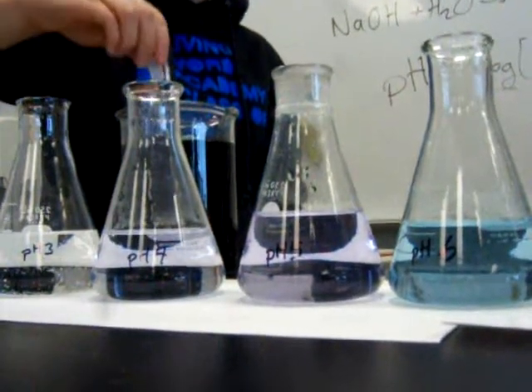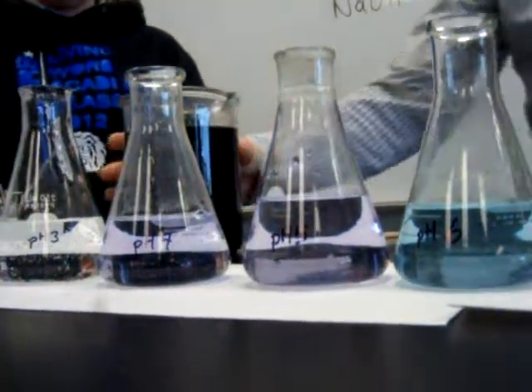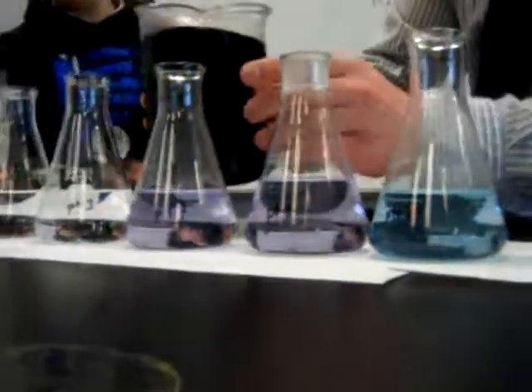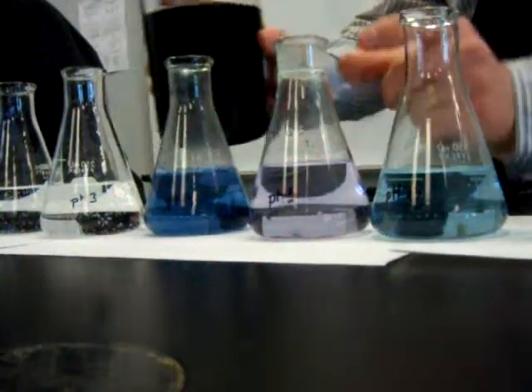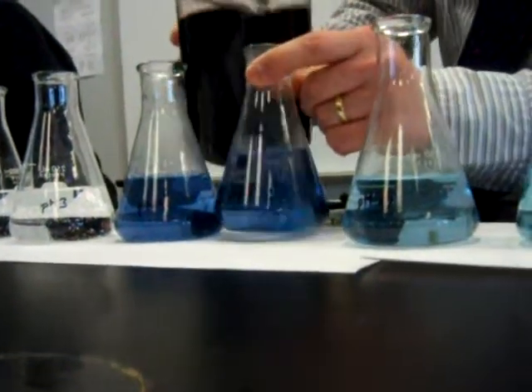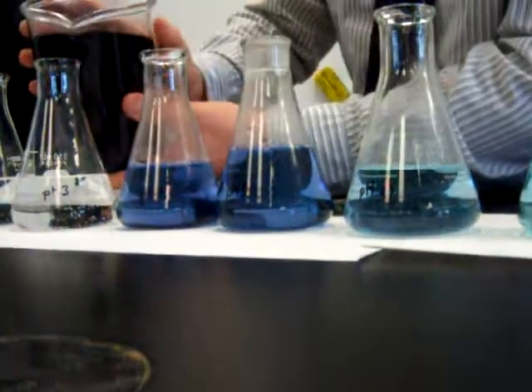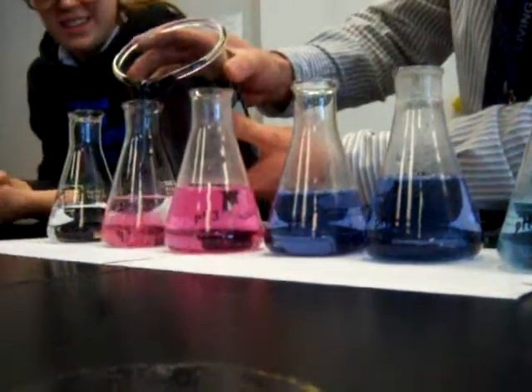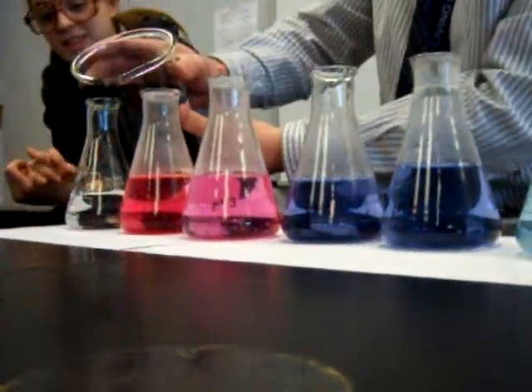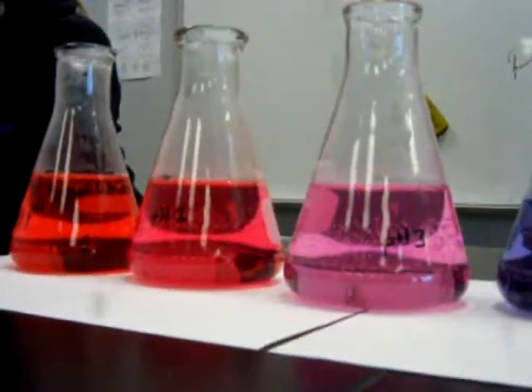Maybe we should just pour it. Let's just do that — it's warm though, it's gross. Can you pour some more in? It's going to get a little messy here. I'm also changing the pH a little bit too. That's cool — oh, that one's bright! That is awesome!